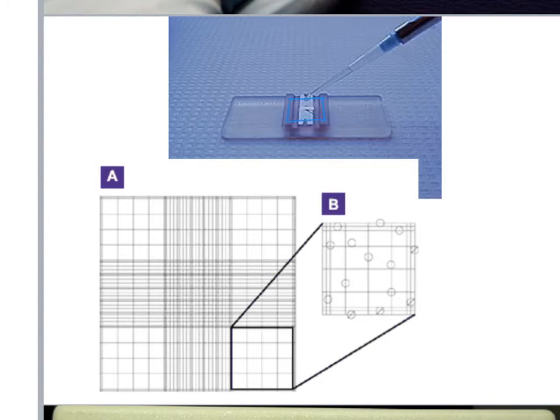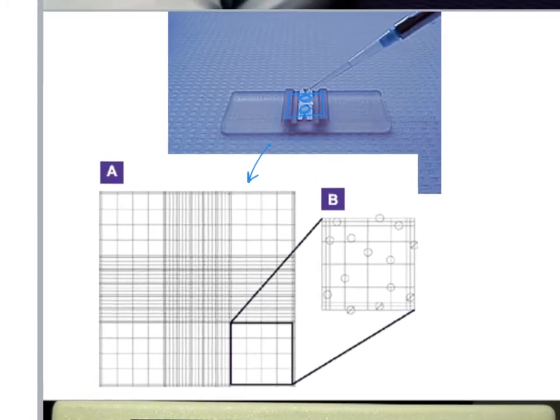All right, so basically right here and right here on this slide, there's an etched grid, and you would only see that if you were looking through a microscope. And then you count a certain number of squares in that grid, how many cells are visible. So in this example, that would be fairly easy to do. You have a nice countable range of cells here, and you take the number that you count and you can mathematically extrapolate back to how many cells were in your original sample.